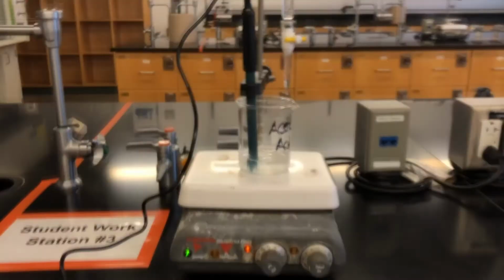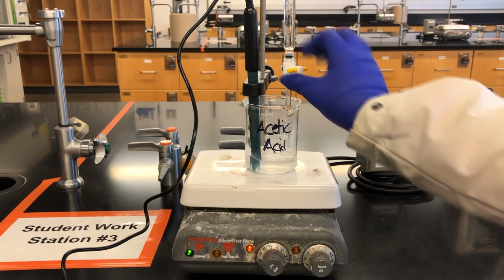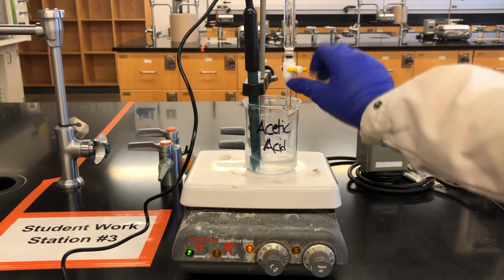This titration is performed the same as Part C. We record the starting point, and then repeatedly add half milliliter portions of titrant, recording the pH each time. After reaching the equivalence point, we add another 6 half milliliter portions, recording each time to finish off the titration curve.